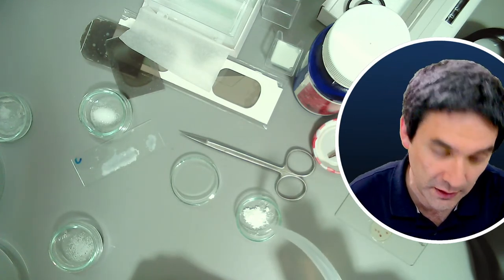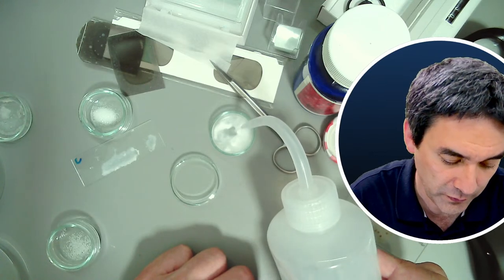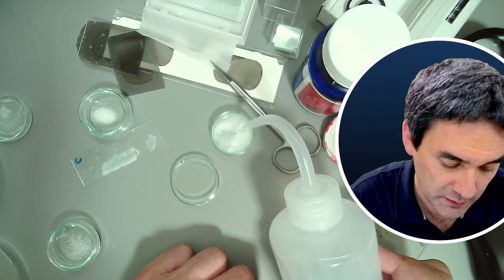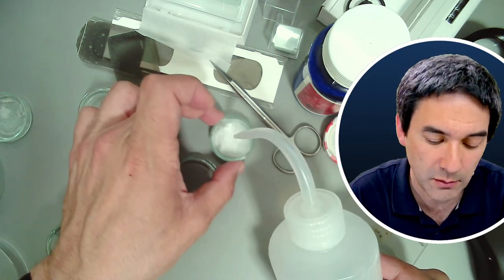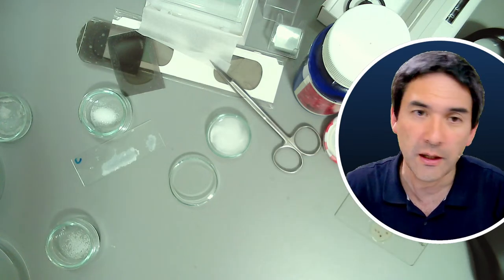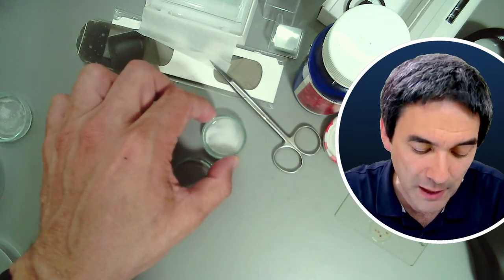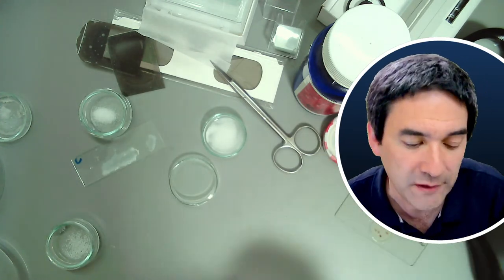So all I'm doing right now is adding a little bit of alcohol, and I'm just going to wait a minute or so for the caffeine to dissolve, but there will still be a lot of powder left, because that is the cellulose filler, which is not the caffeine, obviously.